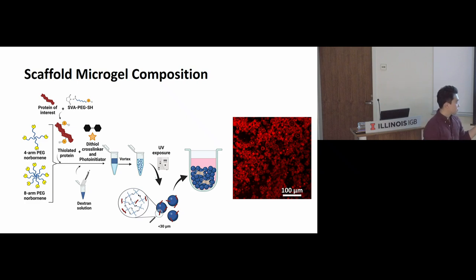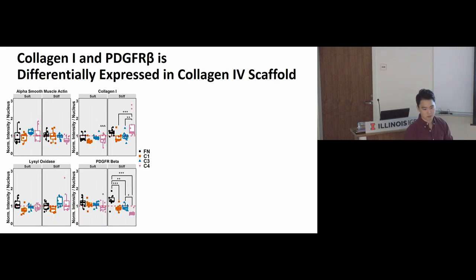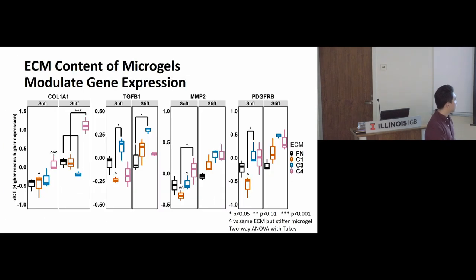And for staining, for the microwells, I was still able to stain, right? Because the microwell itself is retaining the structure. That's why for qPCR, it's very similar to the sensor system with microwell retaining structure. For the qPCR, these were bigger wells, and for that I don't care if the structure is lost. It just lyses.